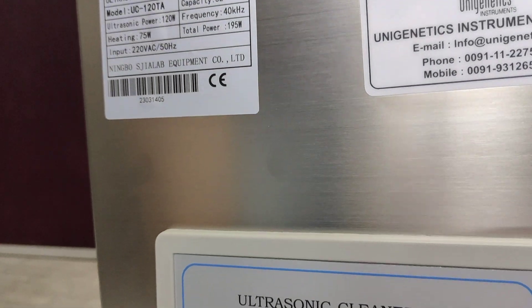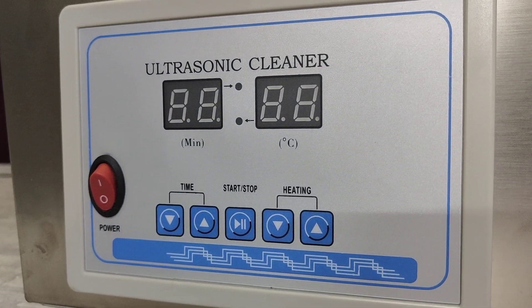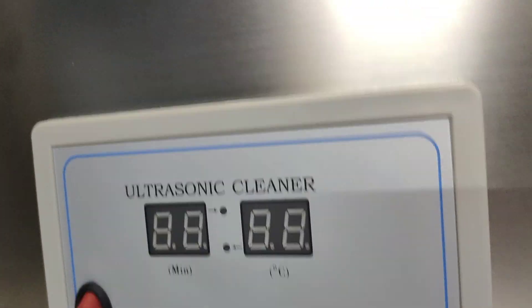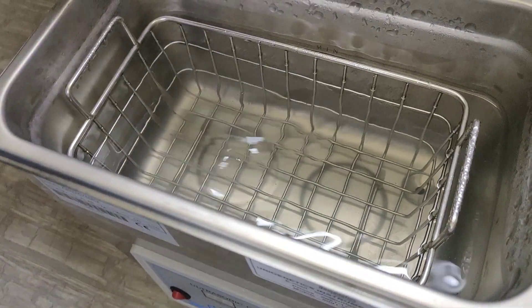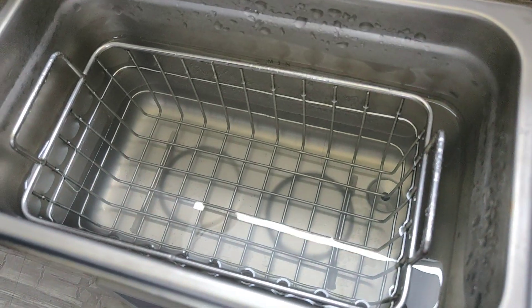The frequency is 40 kilohertz. This machine is used basically for a lot of cleaning applications. This is the tank where you can see that a grilled basket is there.